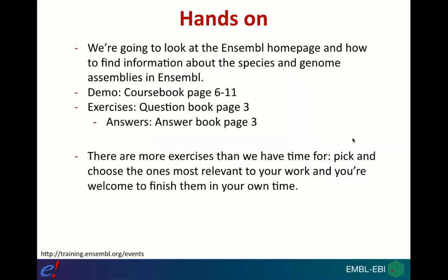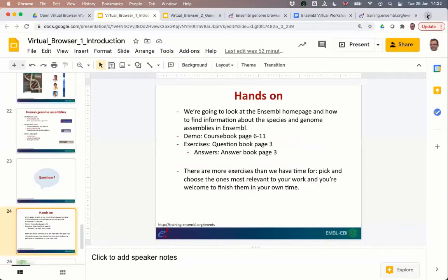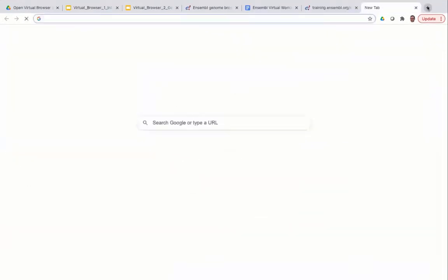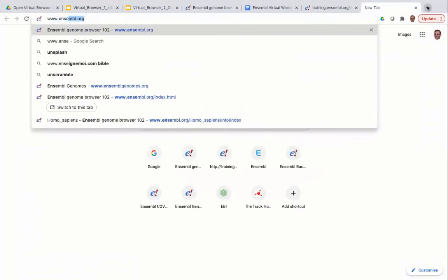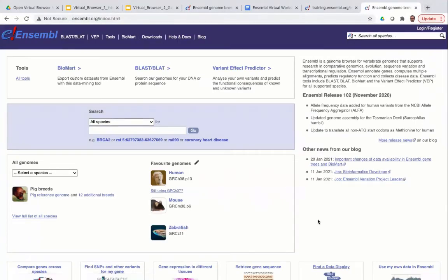In our first demo we're going to look at the Ensembl homepage and how to find information about the species and genome assemblies we have. If you're following along in the course book, screenshots start on page six. In your browser, type www.ensembl.org. That takes you to the main Ensembl homepage. There's a lot going on, so let me walk you through it. At the top is a blue navigation bar that appears at the top of every page — you can always click the logo to come back to the homepage, or navigate to different tools or documentation.